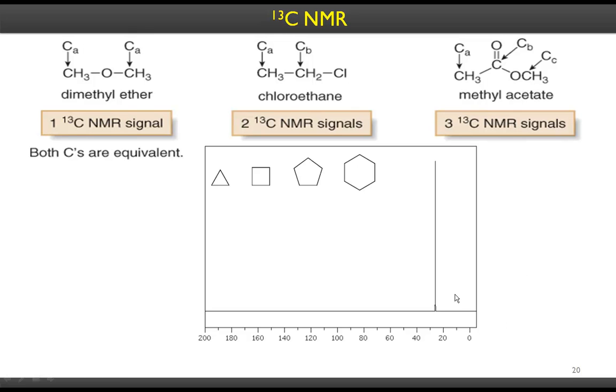They are equivalent to the non-equivalent carbon-13s, carbons. So, for example, all these compounds here, cyclopropane, cyclobutane, cyclopentane, cyclohexane, have one type of chemically non-equivalent carbon, so you get only one peak. This CH2 is the same as this CH2, and so is that, so is that. So you have symmetry, and symmetry simplifies the NMRs, right?